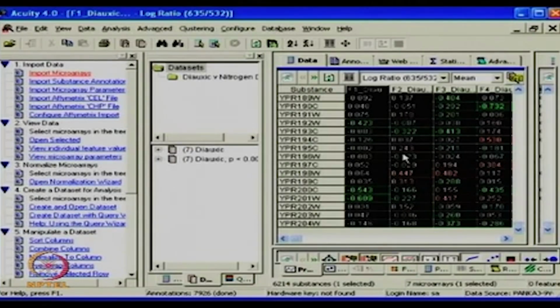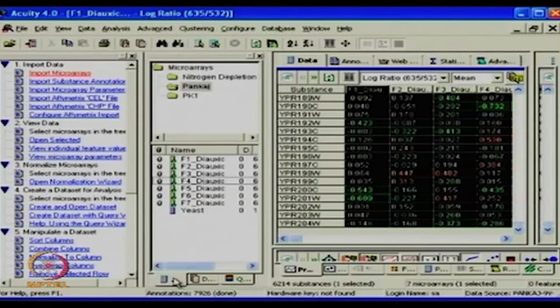So usually differential expression data is logged. The meaning of log to the base 2 is essentially that a log to the base 2 value of 1 is equal to a twofold change. So when you are talking of log to the base 2 value of 2, you're talking of a fourfold change, which really becomes significant. You can filter based on different parameters and generate the data sets. So essentially you are reducing the numbers so you make more sense in the form of visualizations. Right. Otherwise, you can also take all the data and do it. Let's quickly see how we can do that particular job.